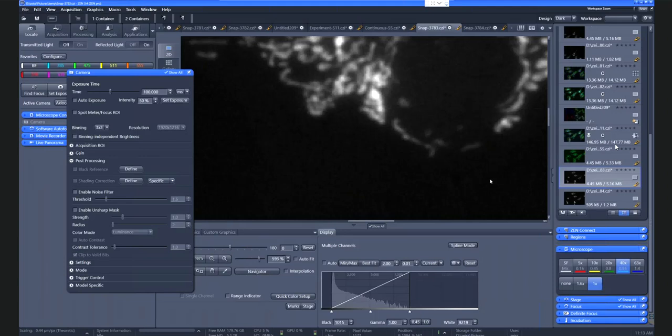Whenever we have too much light on our samples, we might already run into saturating the fluorophores, which is never good. So it's sometimes better to reduce intensity and extend the exposure a bit. But try it out. Always reduce as much as possible. And in case your sample does not look happy after a long session, try to live with the poorest image quality which still gives you some results, to make sure that your sample is still under physiological conditions.